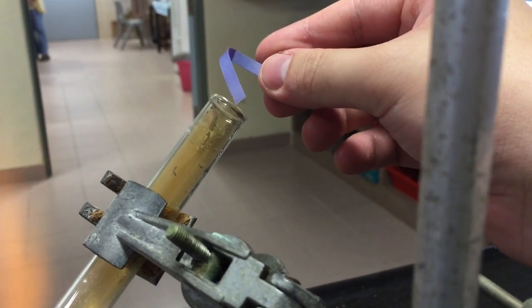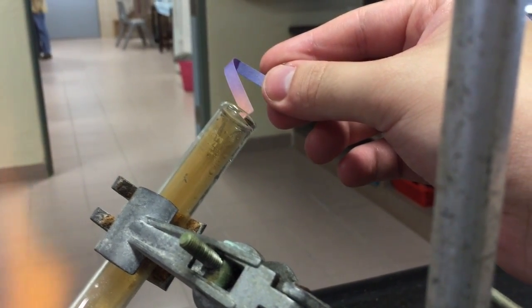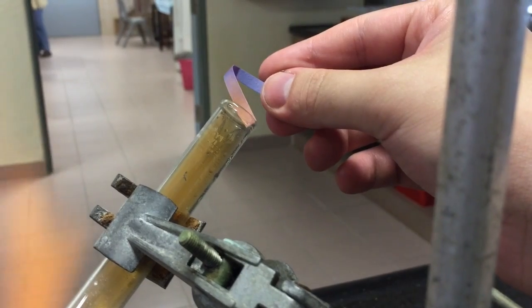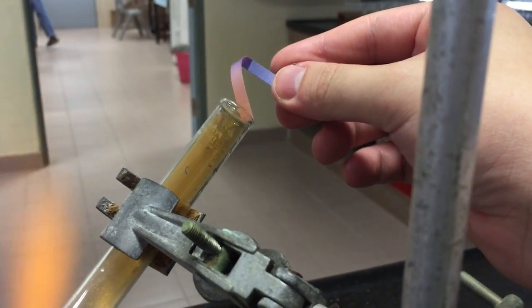Place a moist blue litmus paper near the mouth of the test tube to test for the presence of an acidic NO2 gas. Notice how the blue litmus paper turns red.